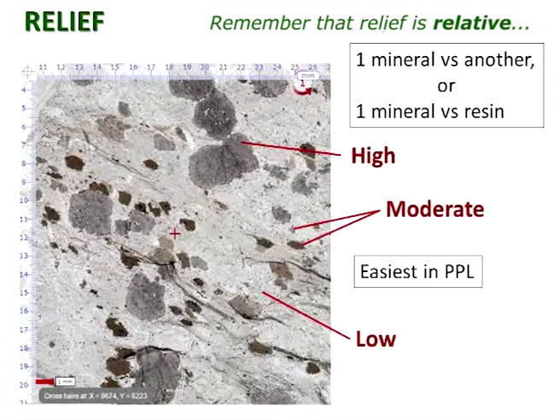Let's look at relief first. One of the things to say about relief is that relief is relative. It's to do with the refractive index, but the way we see relief, the way it's actually displayed to us and the way our eyes perceive it is always relative.